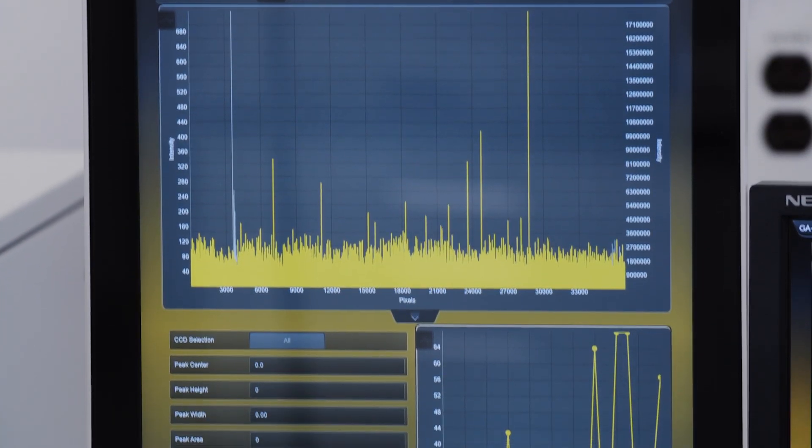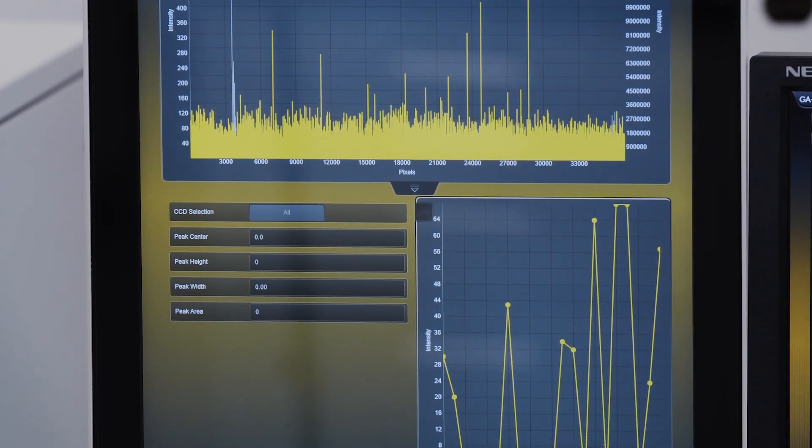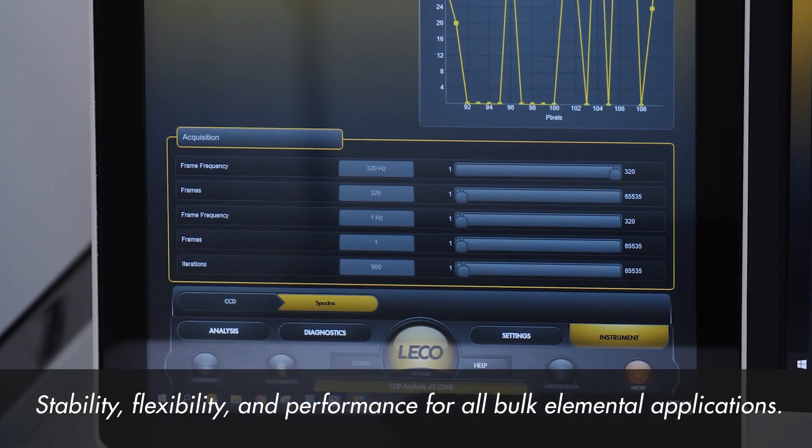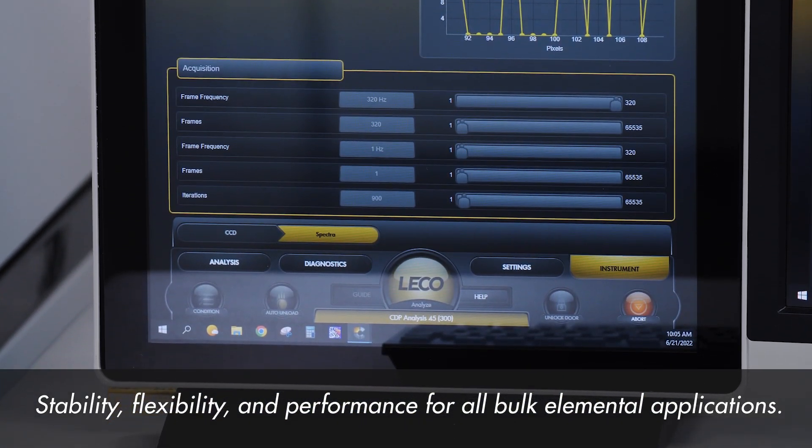The inherent sensitivity, dynamic range, and linearity of these detectors, coupled with a low discharge source, ensures stability, flexibility, and performance for all bulk elemental applications.